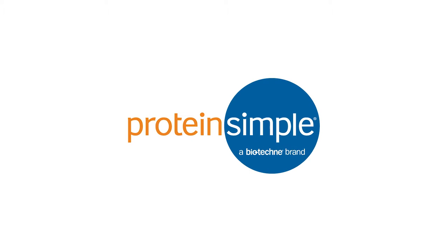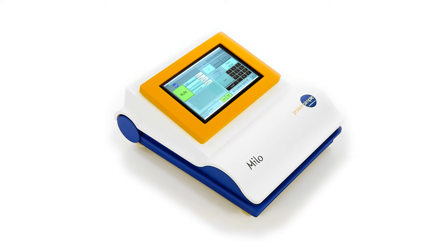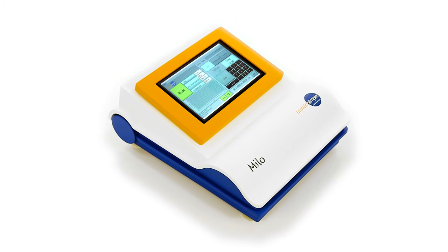ProteinSimple is proud to introduce Milo, the world's first single-cell resolution Western blotting platform.